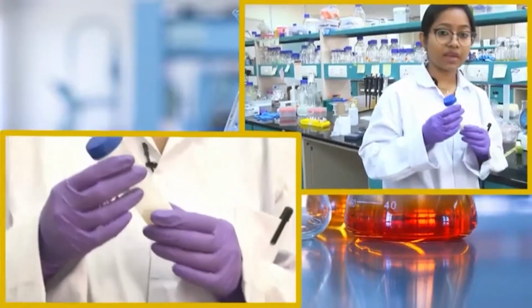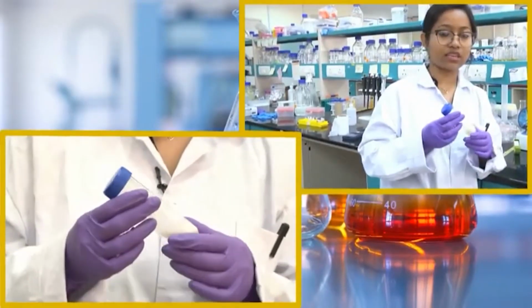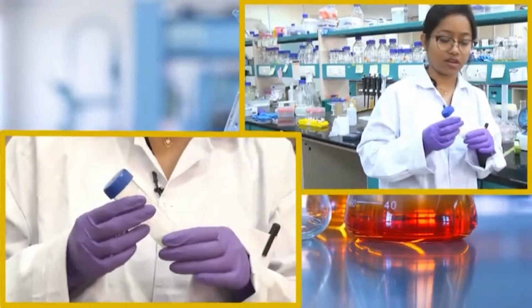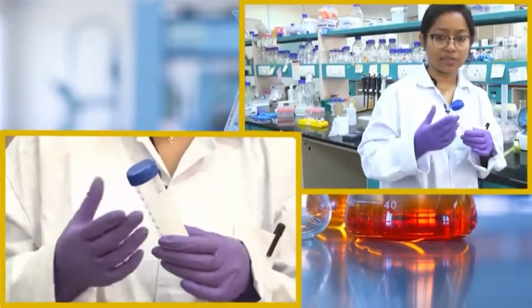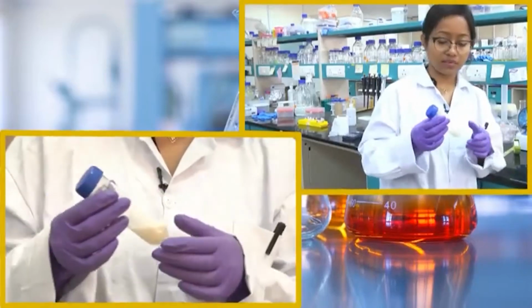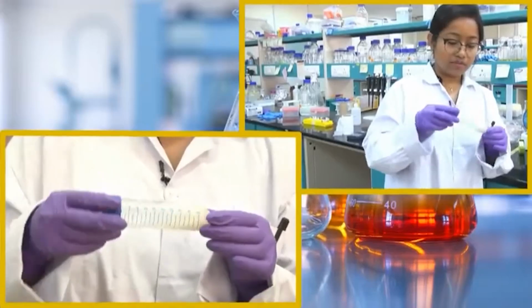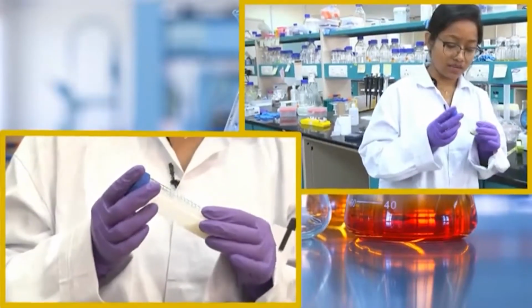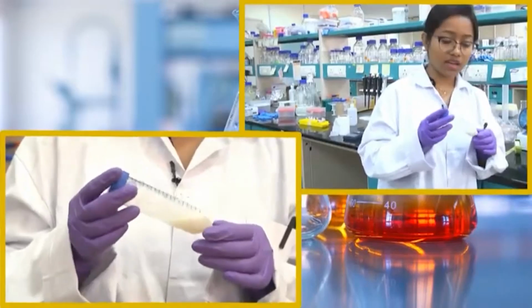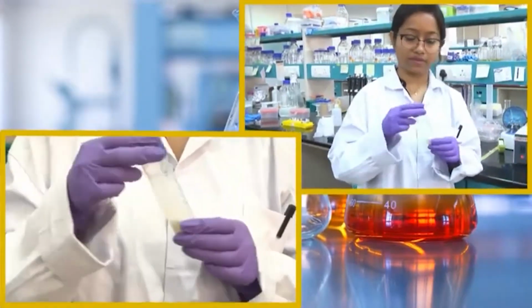Now, lysozyme acts best at 37 degrees centigrade. So, we will keep this solution at 37 degrees centigrade for 20 to 30 minutes. How will we know that the lysis is completed? That part we will show you later. So, now we will keep this at 37 degrees centigrade to incubate it for the lysis procedure, and we will wait, and after 20 minutes I will show you what happens.